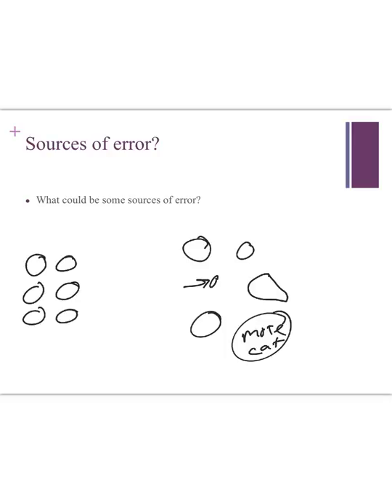Also, when you make up your concentration of hydrogen peroxide, which you should do each time that you change your variable, you want to make sure that you make up that concentration the exact same way. Time can also be a source of error if you're not timing it the exact same way each time. So make sure that you can write down the different sources of error.